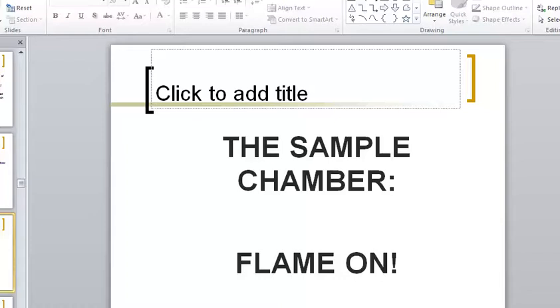Now, I told you the AA is very high maintenance, correct? So that means that you're going to look at this instrument and say it takes longer to set up the instrument than it does to run samples. And, quite honestly, this is the common thing for an AA instrument.